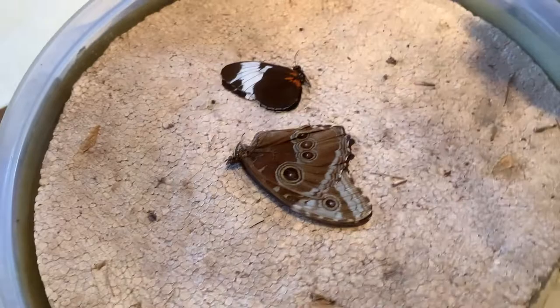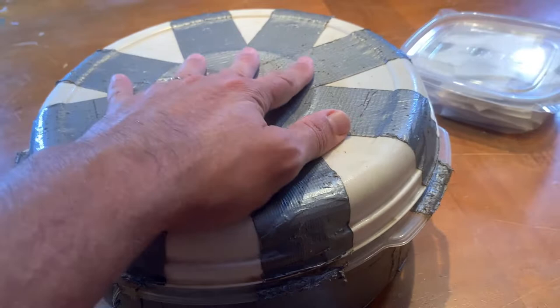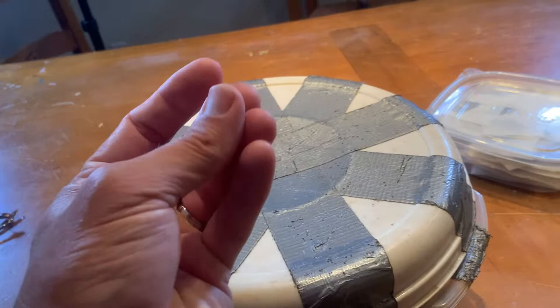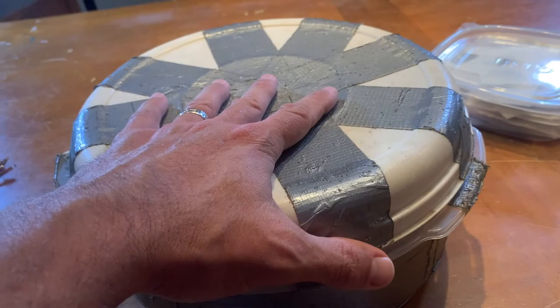Usually if you boil your water, those specimens might be ready to mount and flexible enough within a couple of hours. I would wait overnight — probably the following day before I were to try to do it. I would let them rehydrate for at least five, six, seven hours before I would try to flex their wings.